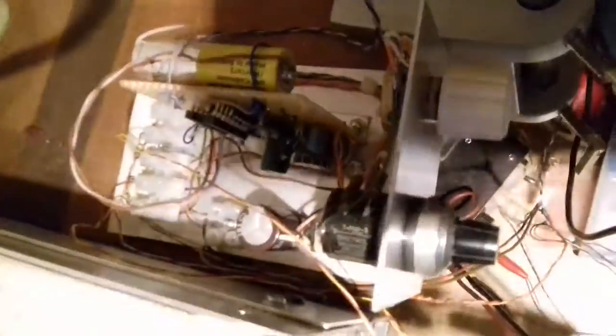That is then run to this differential amplifier, where I reference it to a stable DC source. In this case, just a battery. That's not a very elegant solution, but it does work right now, at least.